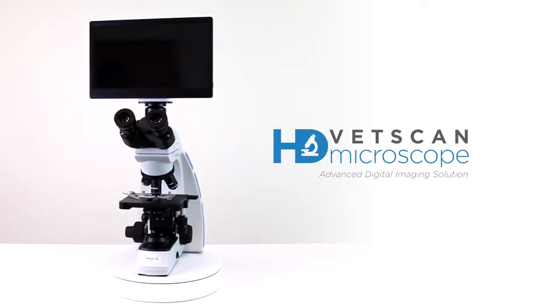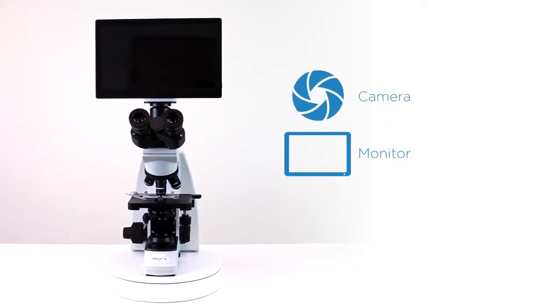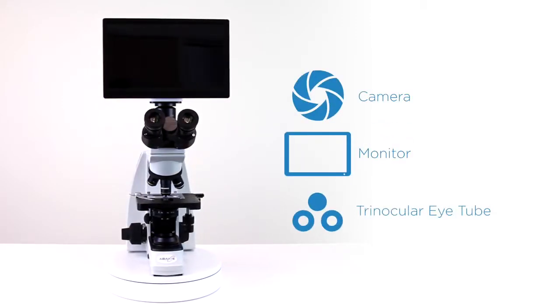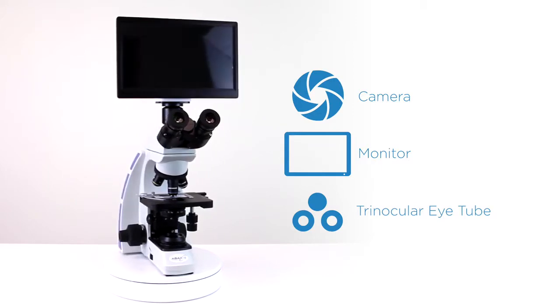The VetScan HD Microscope is a camera, monitor, and trinocular eye tube that provides a digital laboratory experience you would expect from Abaxis.